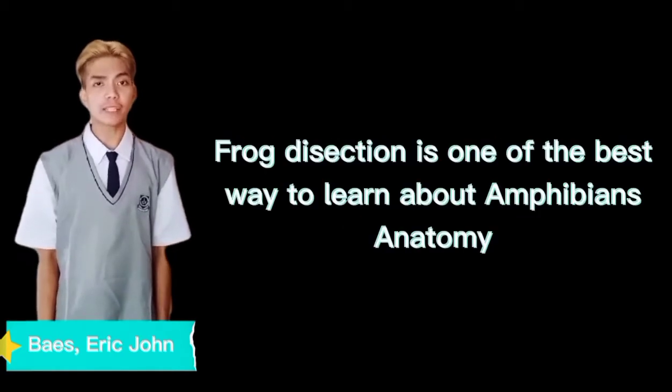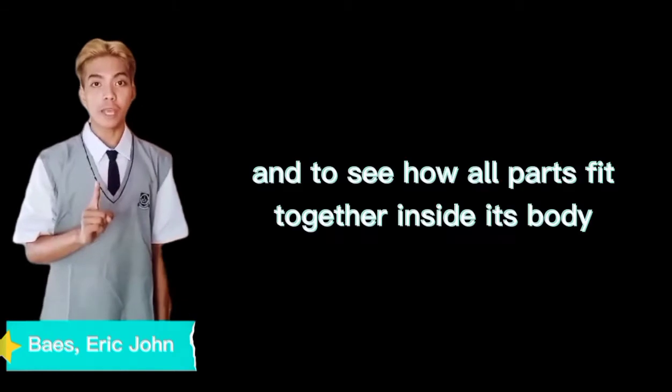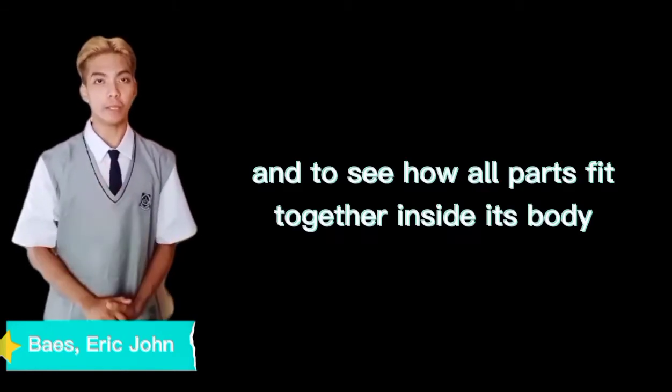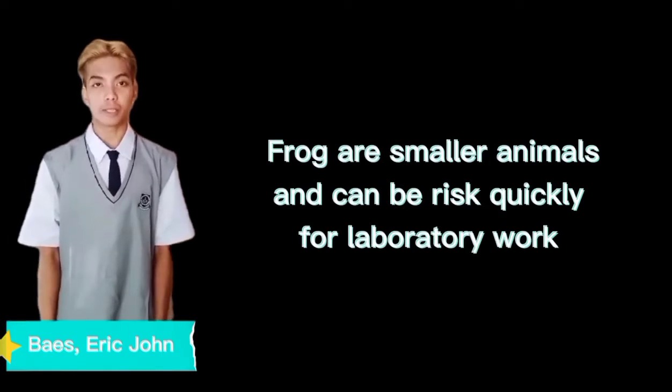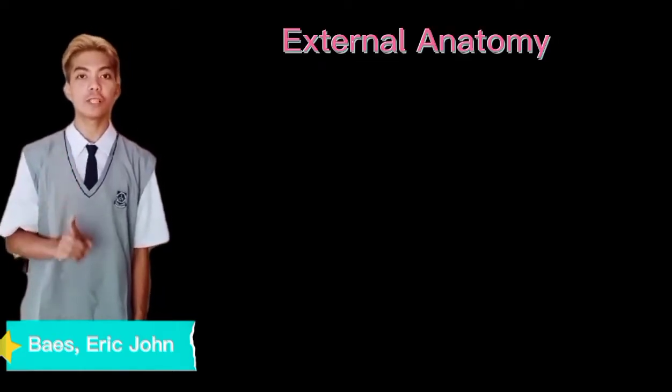Also, frog dissection is one of the best ways to learn about amphibian anatomy and to see how all parts fit together inside its body. Frogs are smaller animals and can be raised quickly for laboratory work. For the first part of frog dissection, we have the external anatomy.